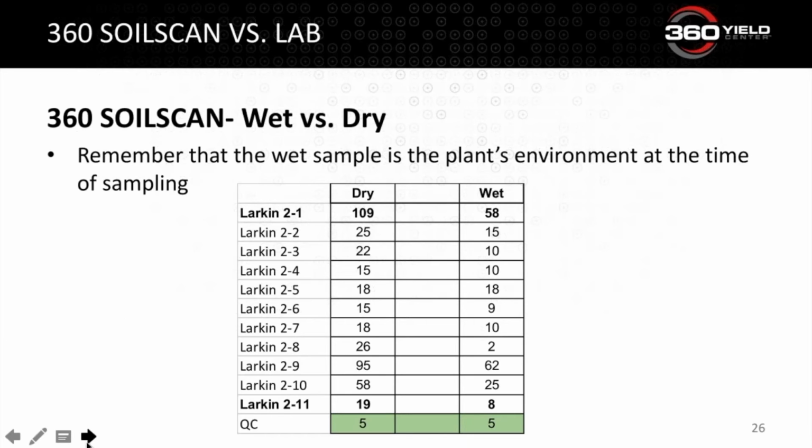So again, what I want you to understand is this is the same sample, and all we did was we ground it, warmed it slowly, dried it at 104 degrees. And so I've shown you 2 sets of data. One was what happens when we handle it, and the other is what happens when we process it, kind of like a lab. Does that affect it?